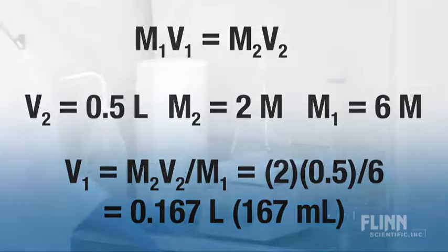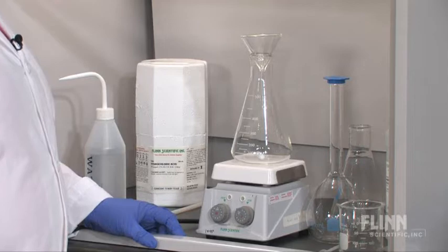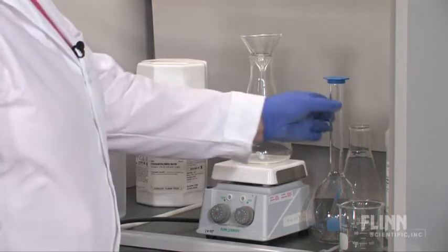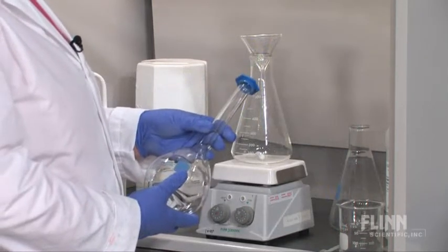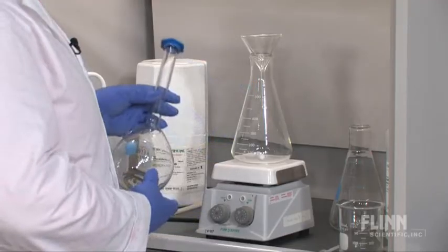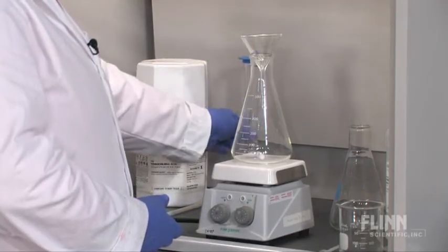Gather the glassware and equipment you'll need. If the acid is for a quantitative analytical experiment such as a titration, use a volumetric flask. In most cases, however, an Erlenmeyer flask will provide the needed accuracy.